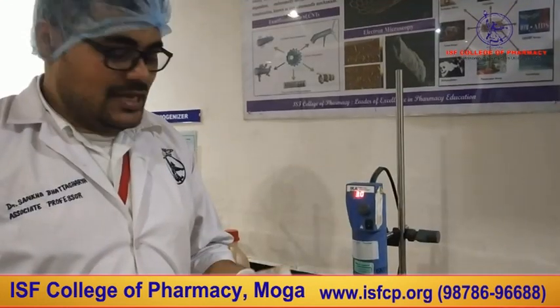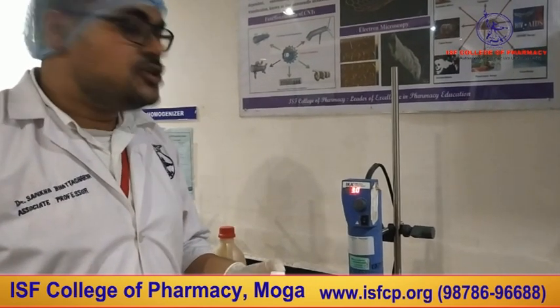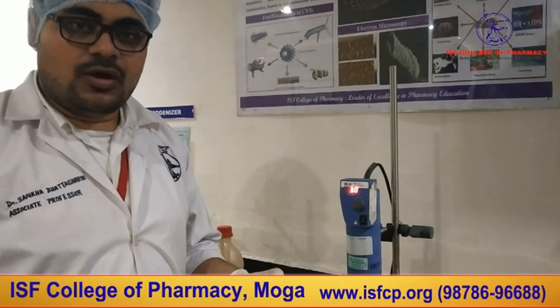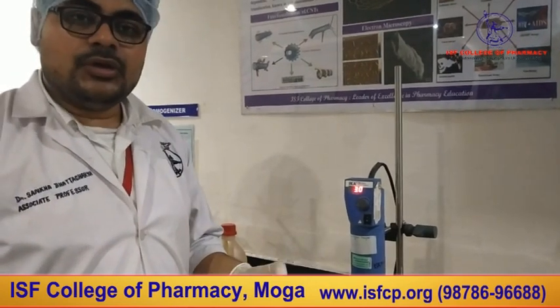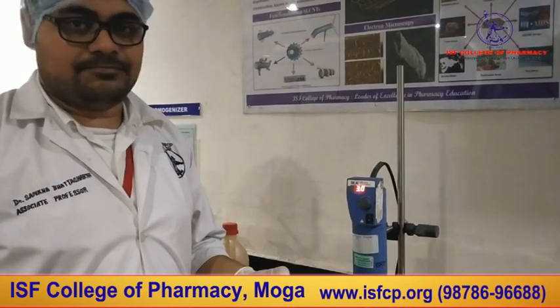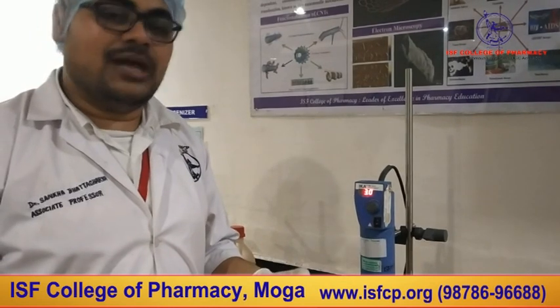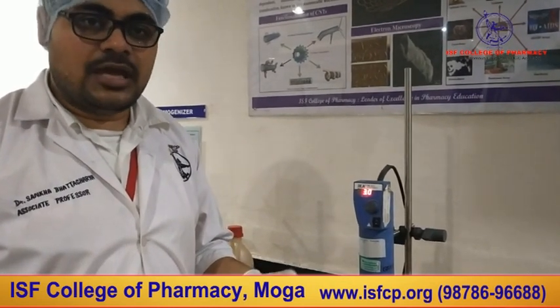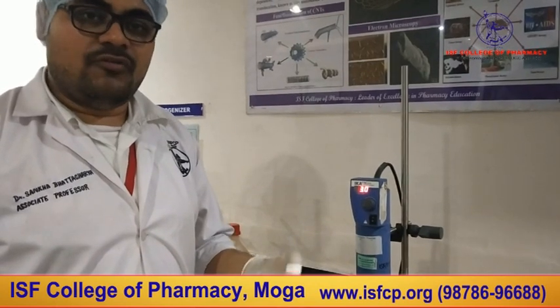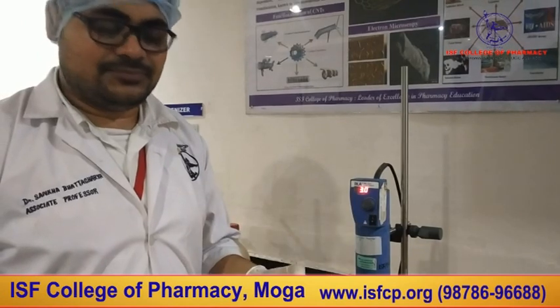For preparation of nano-emulsion, we utilize an ultra-turrax high shear homogenizer with a capacity of 25,000 rpm. While optimizing, we found out that 12,500 rpm is the best rpm for preparing a stable nano-emulsion.